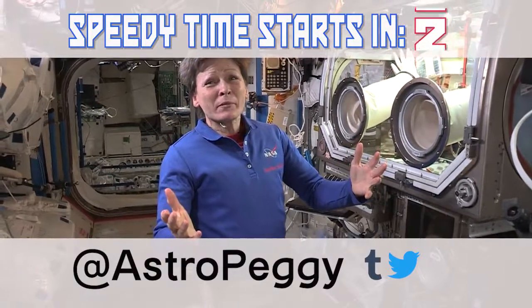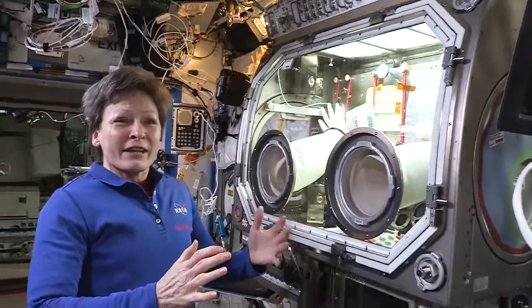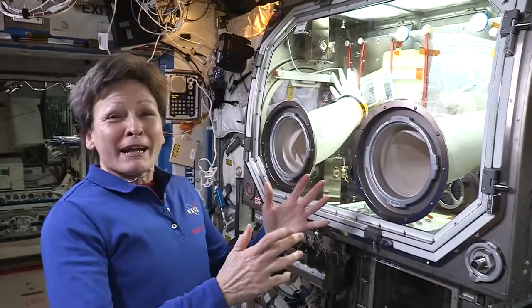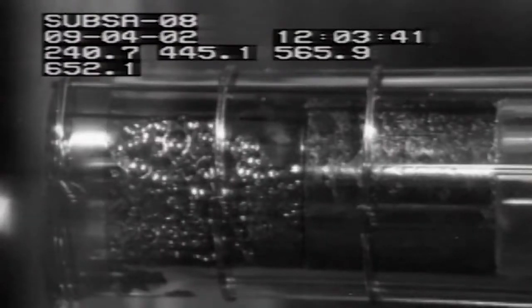Today we wanted to talk to you about the Microgravity Sciences Glove Box. We do all kinds of experiments in here. I've grown tissue culture cells, I've looked at how air and fluid separate, and I've grown superconductor crystals in here — and they got up to over 700 degrees Fahrenheit.